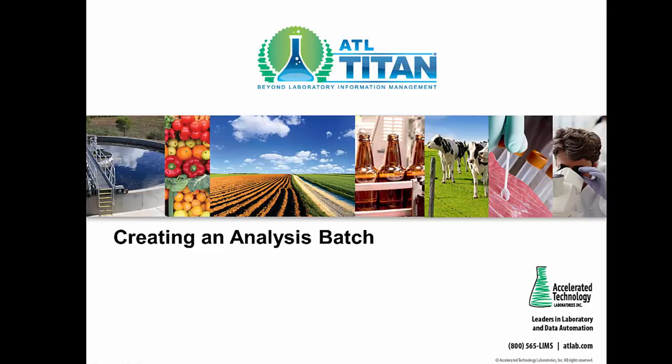Creating an analysis batch in Titan. Now this is done when you want to take one or more aliquots, batch them together, and associate quality control samples with those aliquots, and things like instrument information.